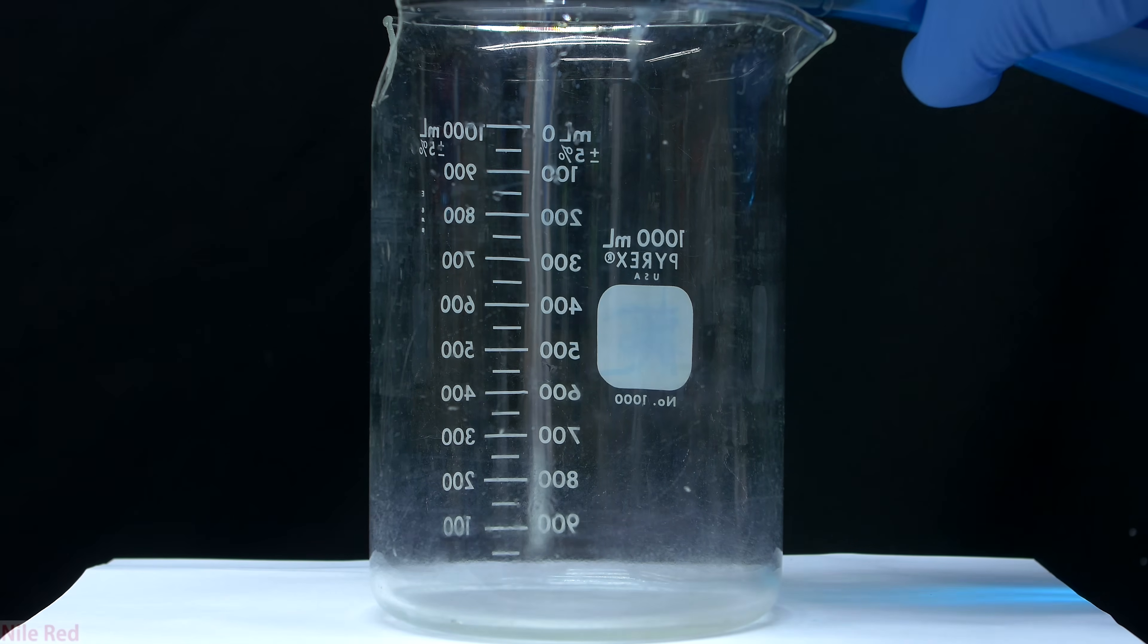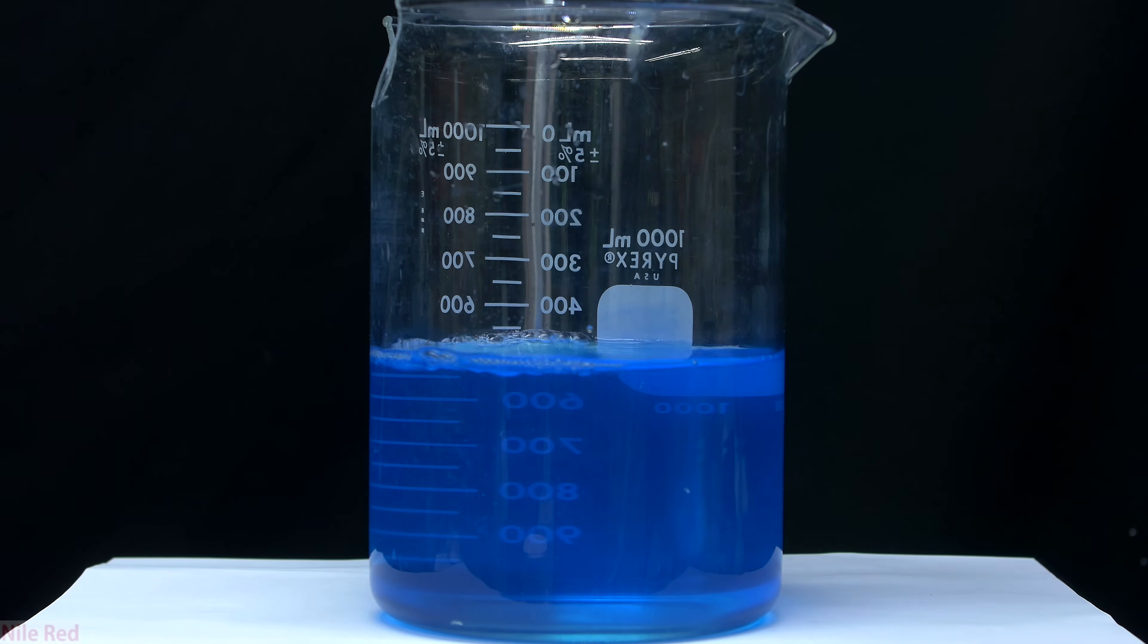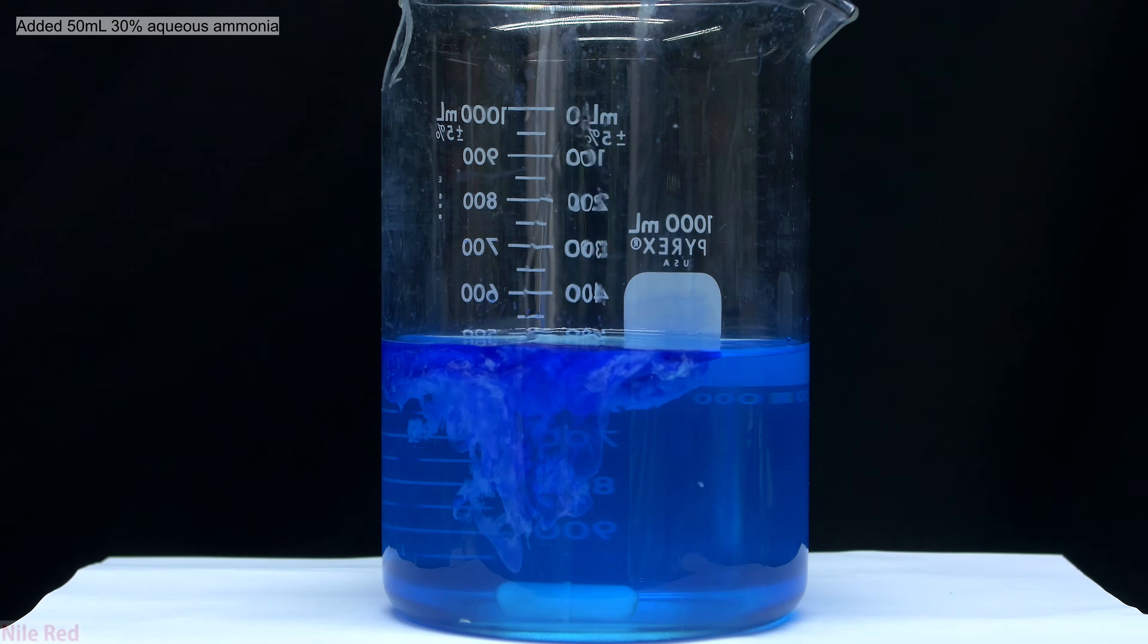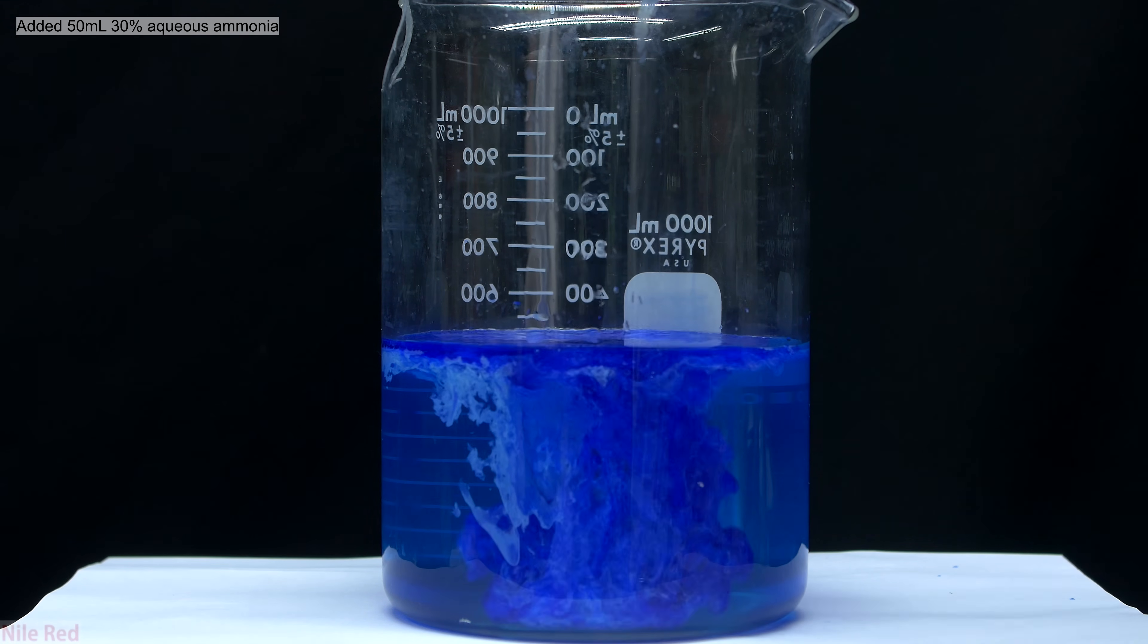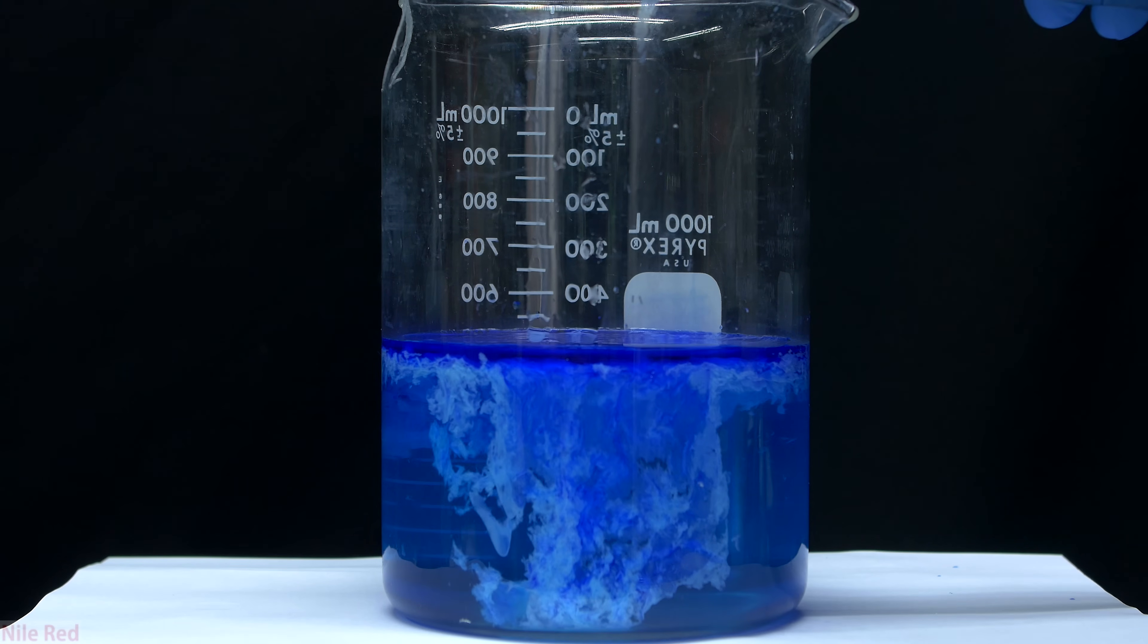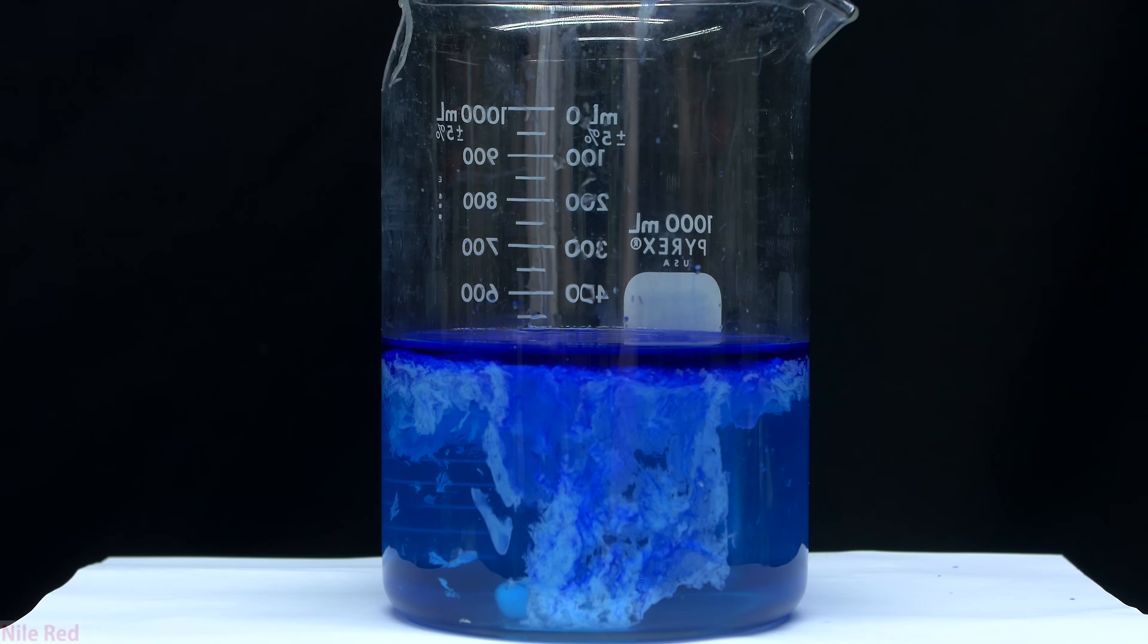So now that our solution is free of insoluble impurities, I transfer the copper sulfate solution to a 1 liter beaker. To the copper sulfate solution is then poured in about 50 milliliters of 30% aqueous ammonia. As we add the ammonia it will initially make this light blue precipitate which is our copper hydroxide, but as we add more it will gradually take on a darker and darker color.